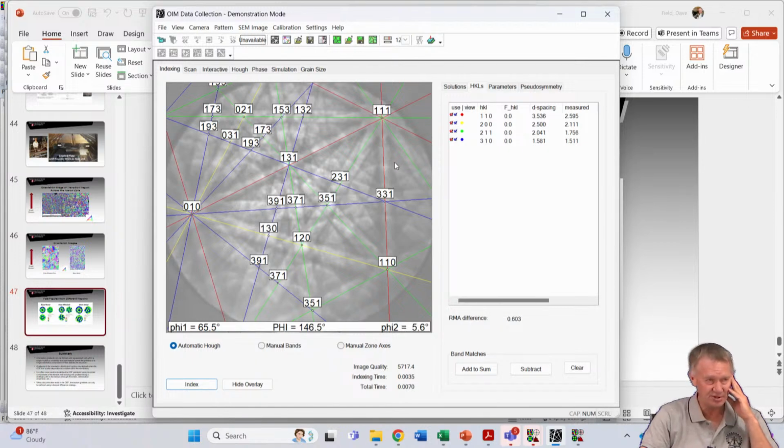That's mostly if you're just starting to do some kind of unknown phase, right? A lot of oxides or borides or carbides or nitrides or something like this will give you some really complex phases. And there'll be a lot of different options, as far as the chemistry of what they should be. So it's good to go in and say, okay, this is exactly what I want to use.